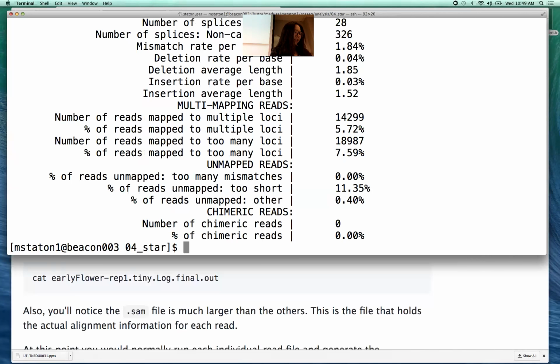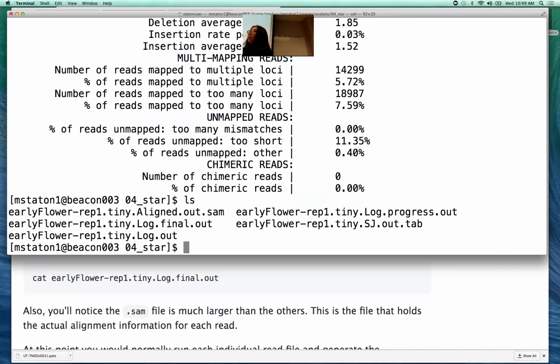All right. And the SAM file is actually our alignment file. So all our alignments are put in these files, and it's human readable, but it's not machine readable, because if we want to visualize our mapping, we have to convert our result for a software called IGV, a genome viewer, and it's not recognizing the SAM file.